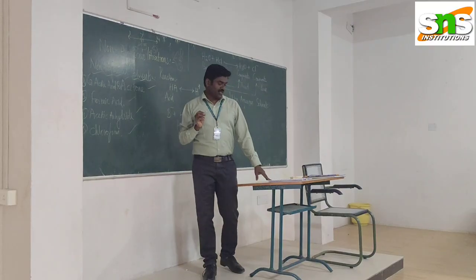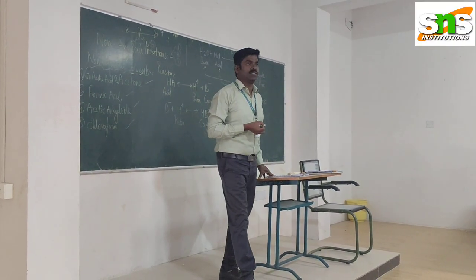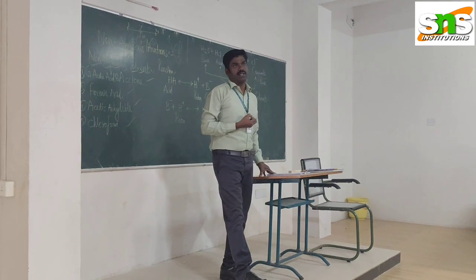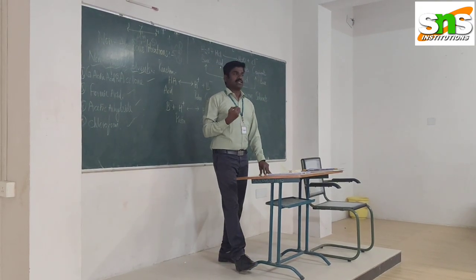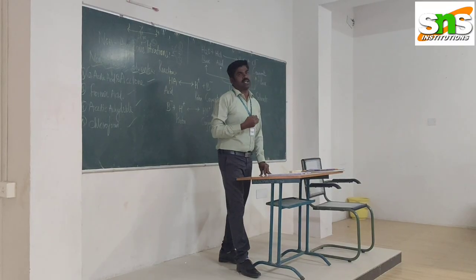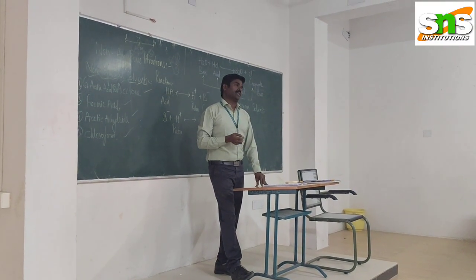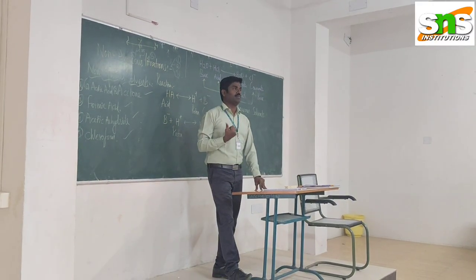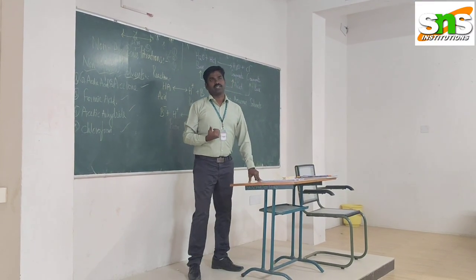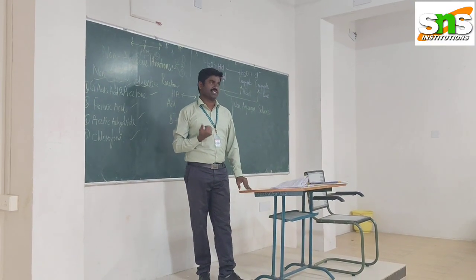So I am repeating, the non-aqueous titration is suitable for three categories of drugs. One is the drug that is insoluble in water. The second category is the drug that is poorly soluble in water. The third one is the drug that is weakly acidic or weakly basic in nature. Such drugs we give preference to this non-aqueous titration technique.